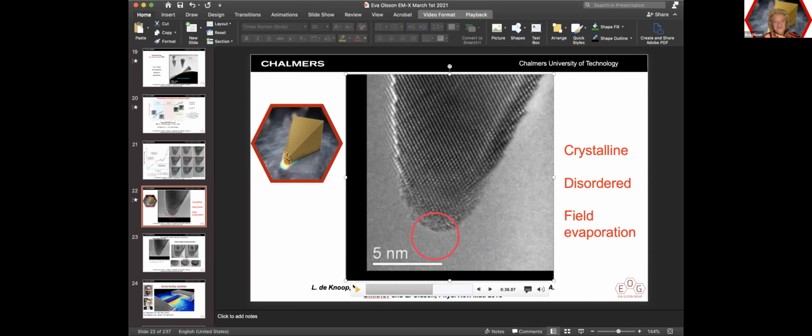Cool. Sounds like a really great measurement. Also in these experiments, were you able to do any spectroscopy to map out plasmonic excitations that might be emerging from irradiation, even just with the electron beam? You might be able to get some localized surface plasmon resonances that could influence the migration of the atoms or the local temperature.